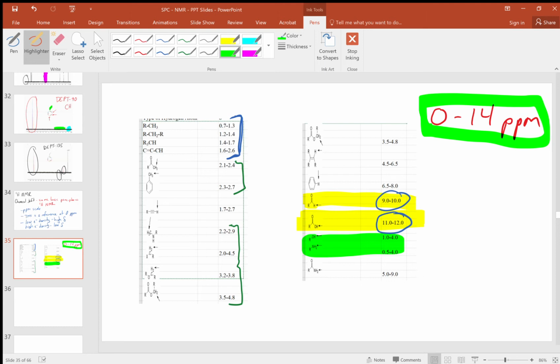So those two groups, the OH and NH protons, are very, very variable within a molecule. But that's okay, because these are two groups that are very easy to identify, as we've seen in IR. So just to sort of summarize this first piece, very, very similar to what we saw in carbon NMR. The chemical shift is determined by the environment that a proton is in.